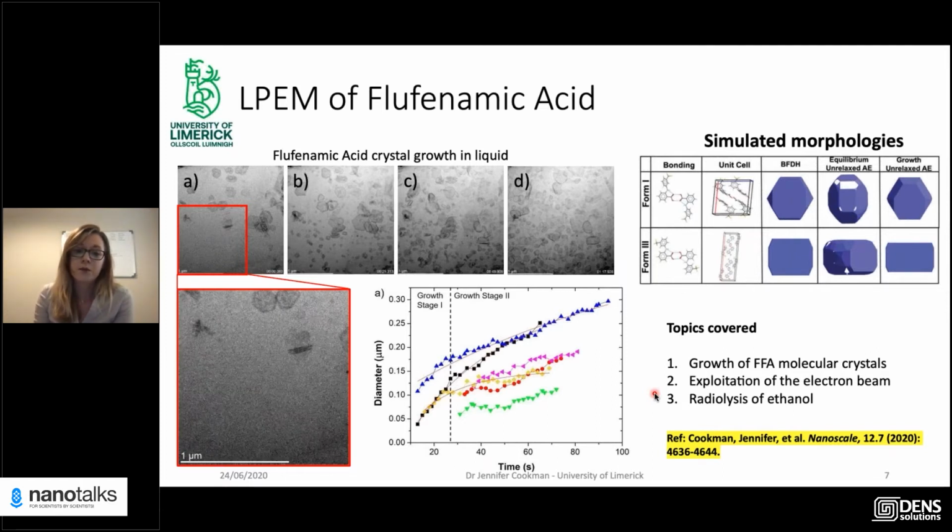So from the results acquired in University of Bristol, we don't expect to see any sort of magnetic field manipulation of the crystal growth to produce an unprecedented polymorph than what we see in normal crystallization events. So I have a frame by frame breakdown here, and the video just on the bottom is playing very slowly. It's a little bit laggy, so I apologize for that.